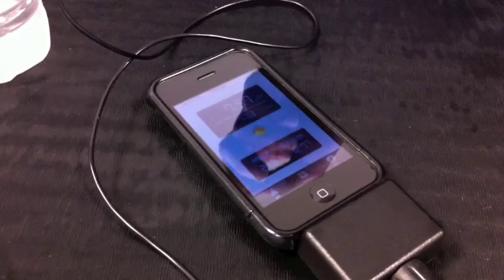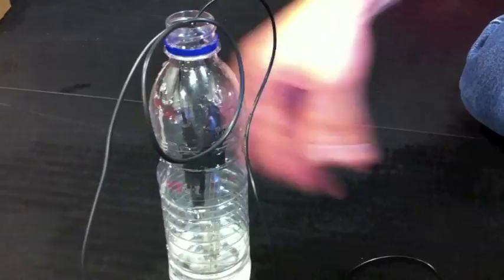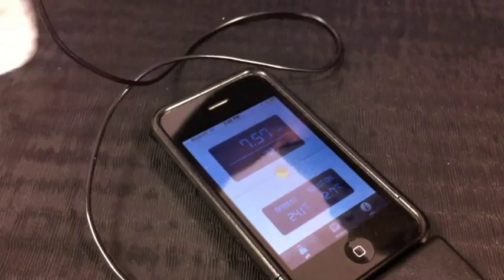There are also PH electrodes with the temperature probe built in. Just as an example, I have here some lemon juice — a few drops there, shake it up, and then I see right away that my reading changes. It's great to know if you've already put lemon juice in your iced tea.